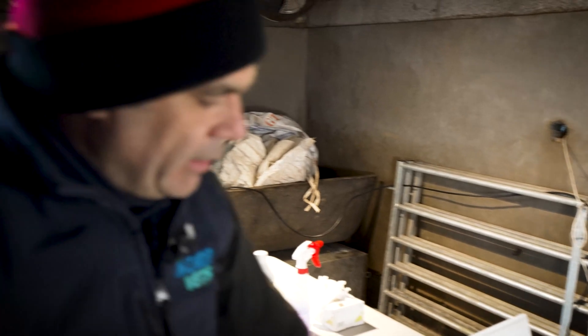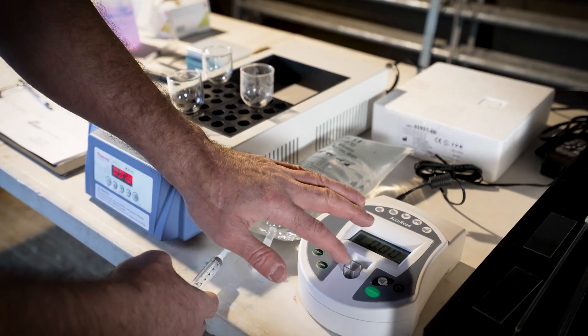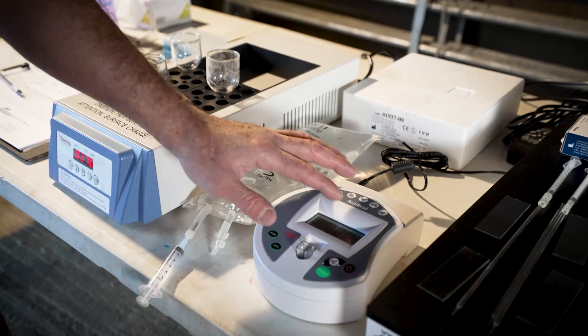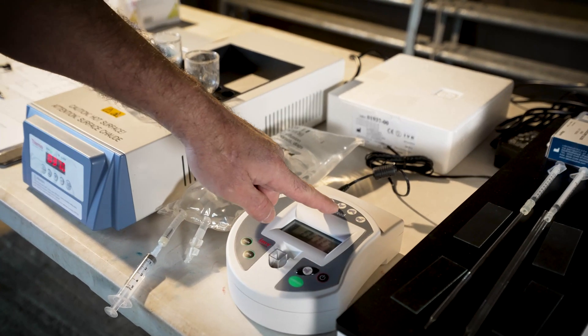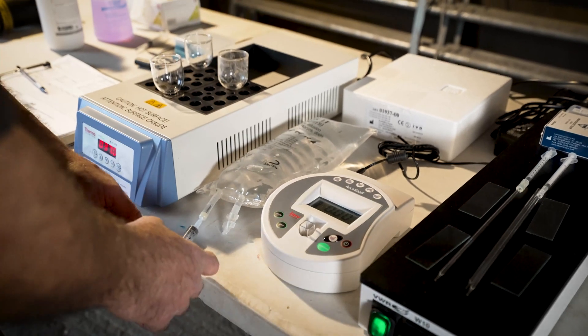What we're going to do next is use this measuring device. We need to put the sample in here in this little receptacle. This is the Acuread. It measures sperm cell concentration in cattle, in sheep, in pigs, in poultry, in horses, goats — pretty much everything.